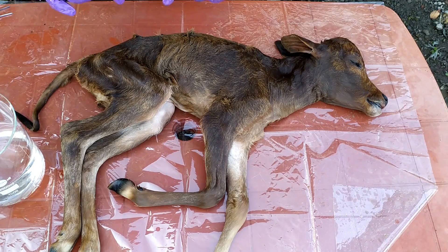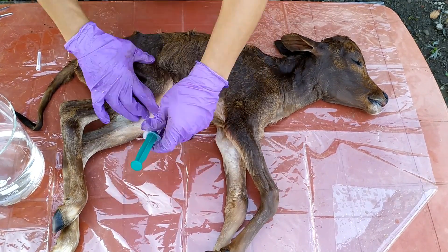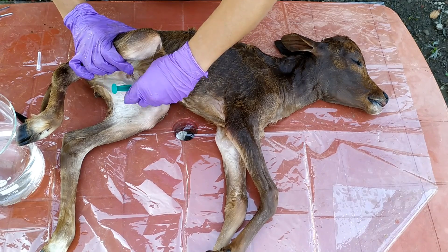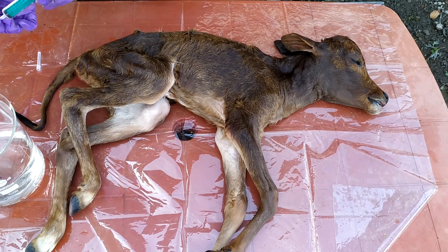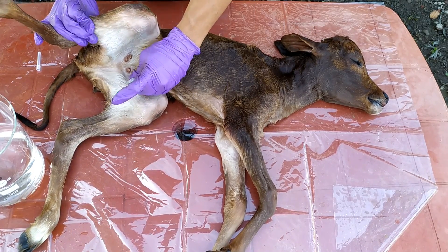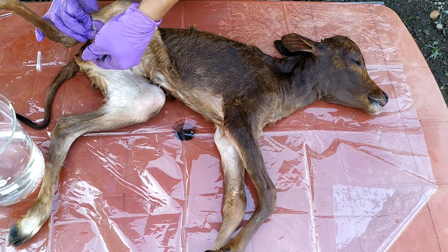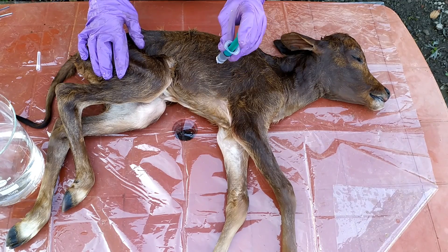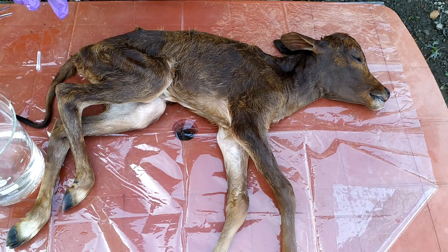Once we are done making slits throughout the specimen, we proceed with the injection step. Using a 10 or 20cc syringe with a hypodermic needle, draw 10% formalin solution to its full capacity and start injecting 2–5 ml each into all the parts mentioned previously. In the abdomen and major muscles, 5–10 ml injections may be made. The 10% formalin used as fixative in this injection process may or may not be buffered. However, keep in mind that one has to use the same type of formalin throughout the processing of a specimen — if you use buffered type, use buffered type throughout the fixation and preservation steps.